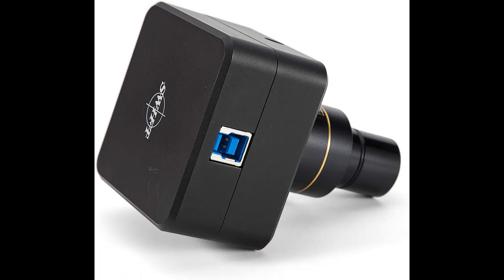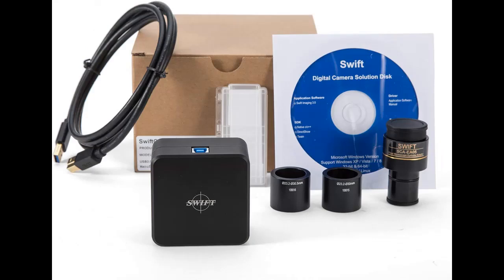The Swift Cam comes with several mounting options for maximum versatility. The reduction lens fits any 23.2mm trinocular port and can also be adapted for 30 and 30.5mm tubes.